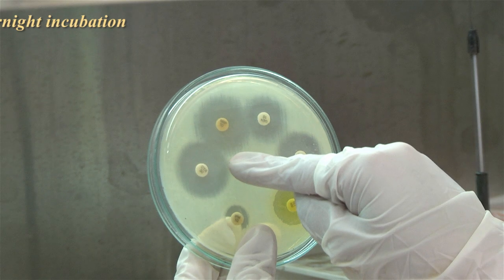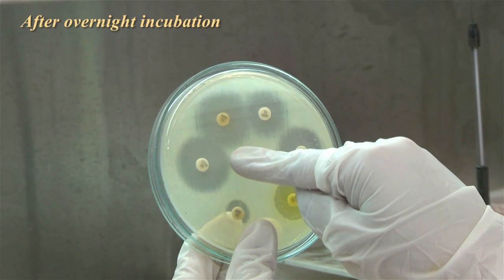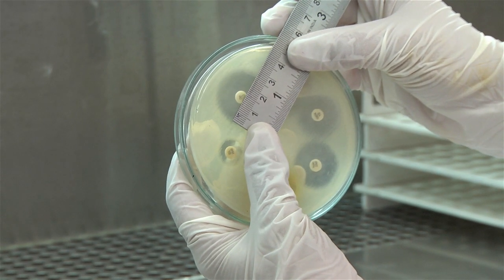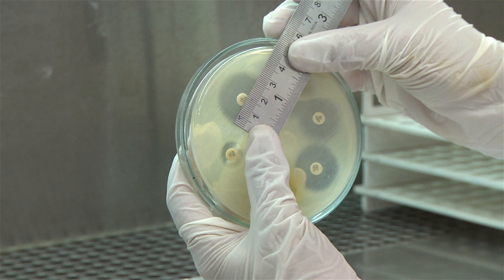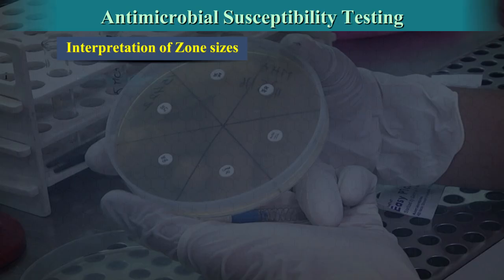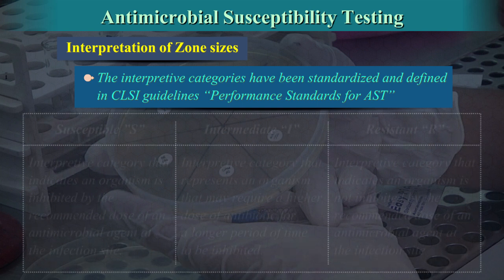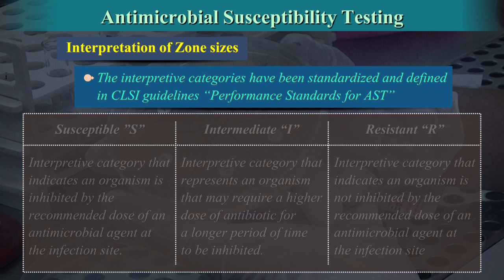Day 3: After overnight incubation, examine the control and test plates to ensure the growth is uniform. Using a ruler on the underside of the plate, measure the diameter of each zone of inhibition in mm. The end point of inhibition is where the growth starts. The interpretive categories have been standardised and defined in CLSI guidelines, performance standards for AST. These charts are available according to the isolates and help in guiding antimicrobial selection.